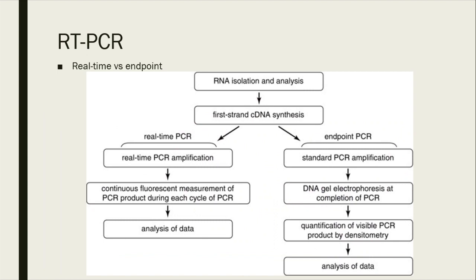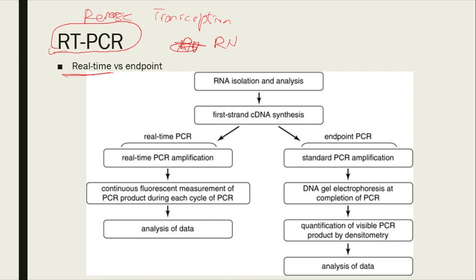Now there are small variations between these RT-PCR, so-called real time. Usually with RT-PCR people get confused. I sometimes get confused myself. Are you referring to reverse transcription or real time? Technically, RT-PCR should refer to reverse transcription, which means going from RNA to DNA. Oh, sorry, very bad handwriting. RNA to DNA.